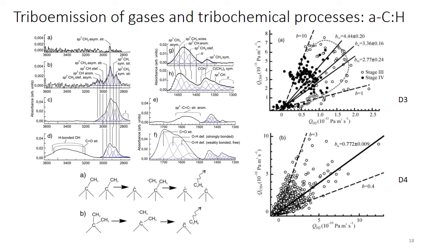So the larger number of CH3 groups we have, the higher the intensity of methane, and so the higher the probability that two hydrogens form the molecule, and this molecule will escape from the substrate. Also, it was interesting that only in the case of highly hydrogenated carbon coating, we found a small contribution from ethane and propane.